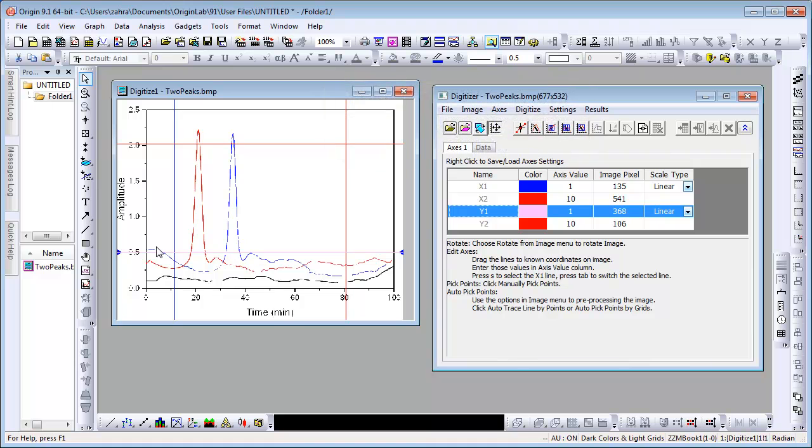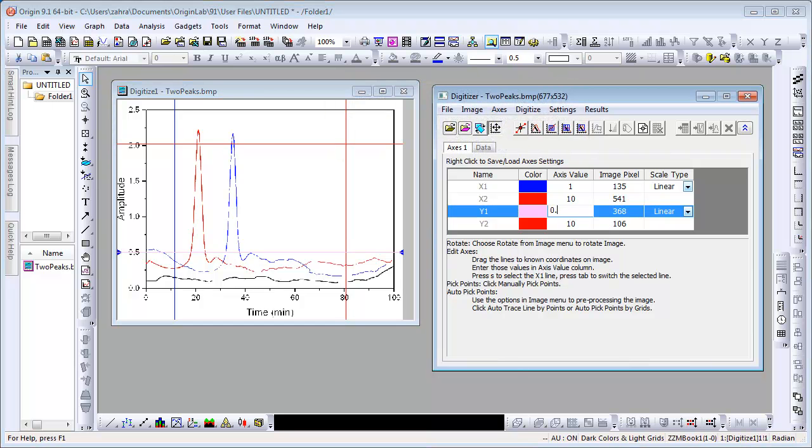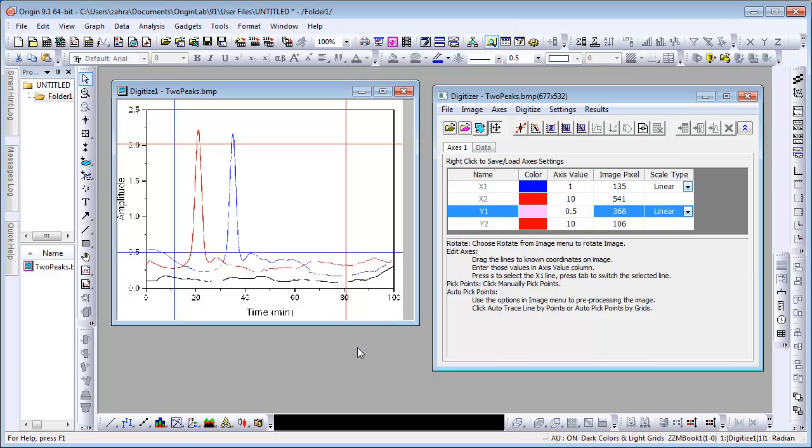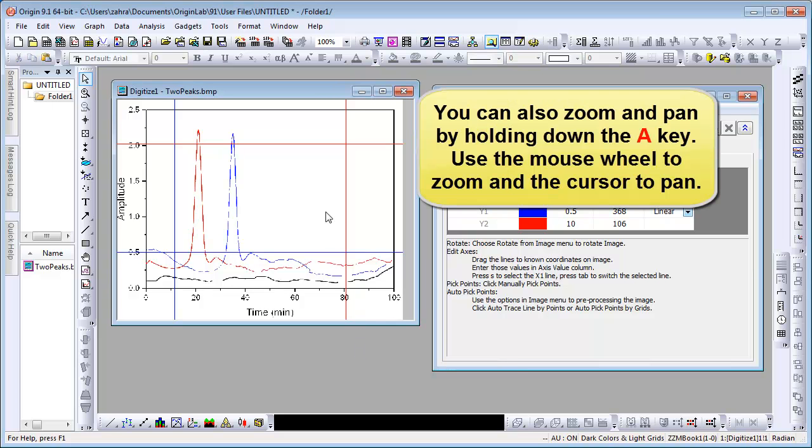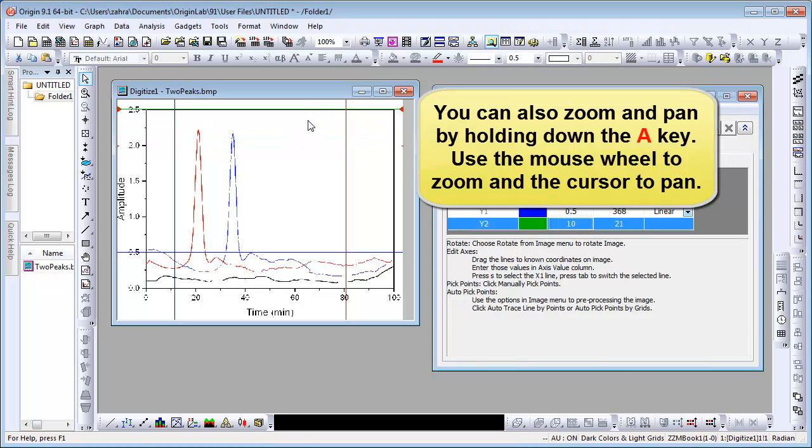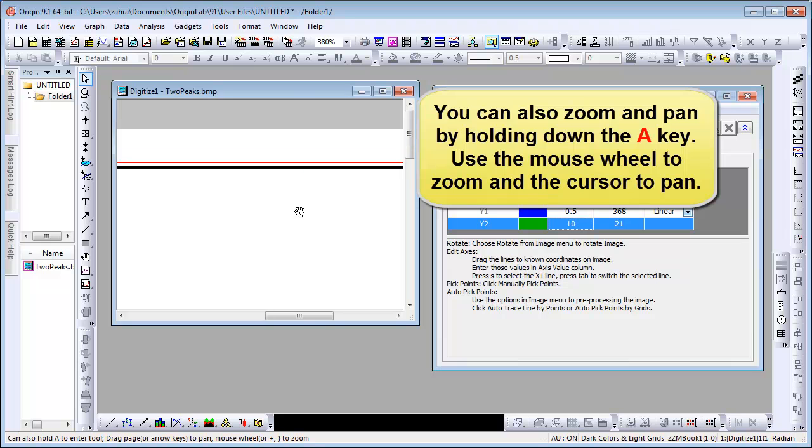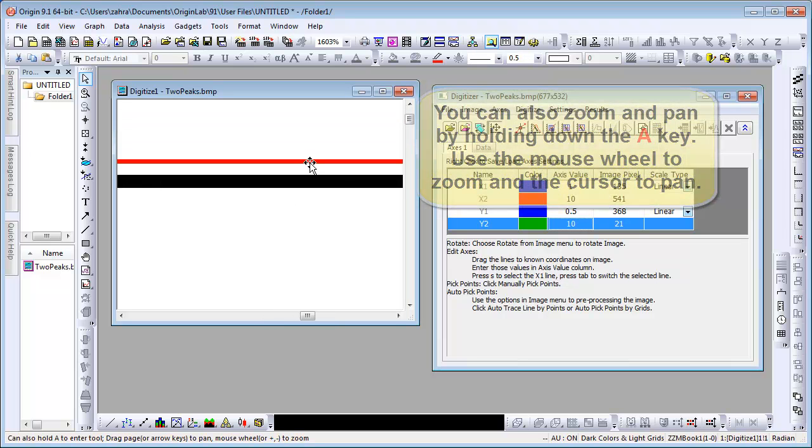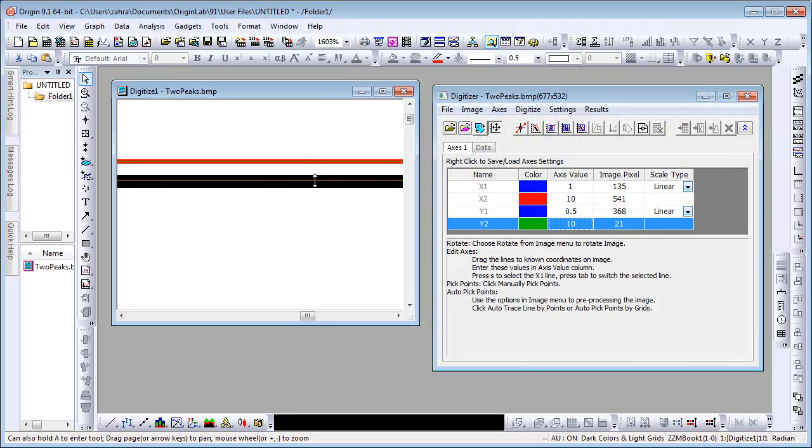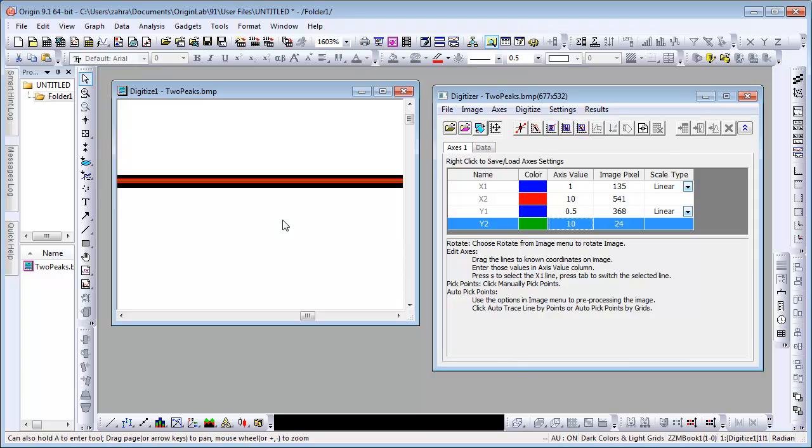Set the Y1 axis value at 0.5 in the Axes tab. Next, we will align Y2. Another way of zooming is to hold down the A key. Use your mouse wheel to scroll and your cursor to pan. Align the axes and Ctrl-W to the original size again.